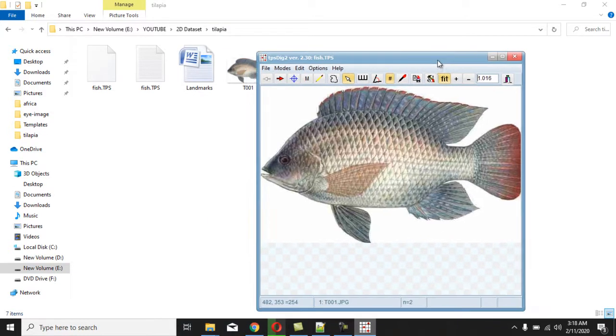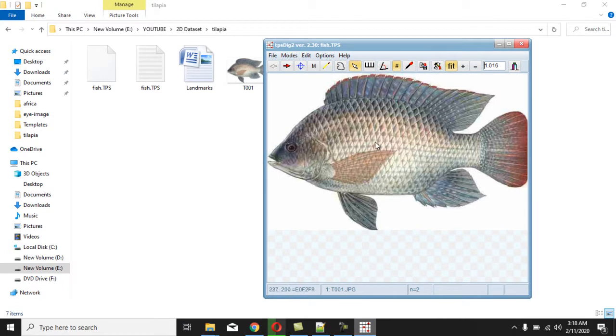What I'm going to do here is digitize this fish. Before we do that, if you click on next, you see the second fish. So we have only 2 fish now. You can see their names down here. The total number is 2. As you are moving, you are seeing the dimensions. But never mind. Why I first did this is so that you can understand the format of this particular file type.